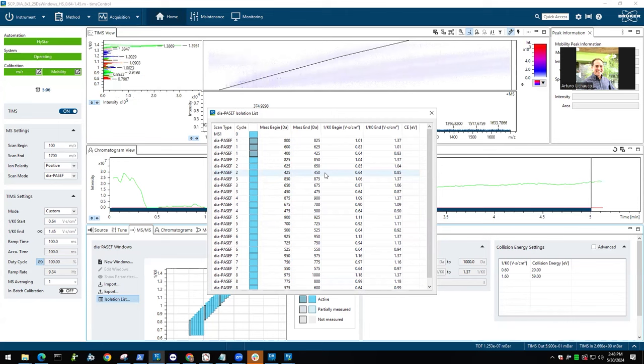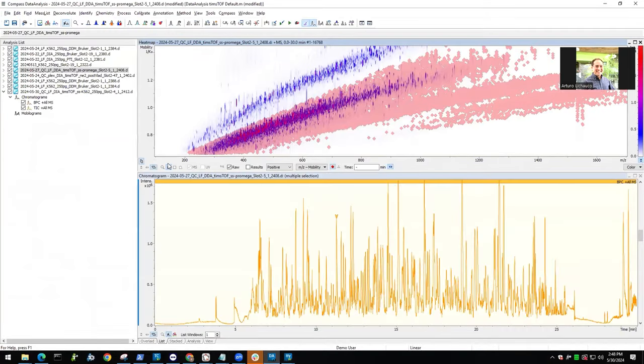So we would include everything in the range 800 to 825 in a certain high mobility phase. Then I go back to this view again. So we would say 800 to 825 in the range where there are molecules. Then we switch our quadrupole to this range, 600 to 625, and analyze what's eluting here. Then we switch the quadrupole to 400 to 425 to collect those. We're making use of the separation and the sequential elution, so that we can switch our quadrupole position within one analysis cycle to analyze more in the same time, basically, right?